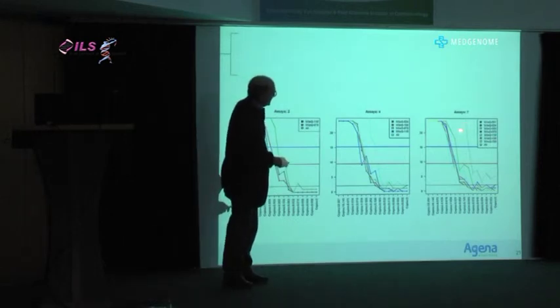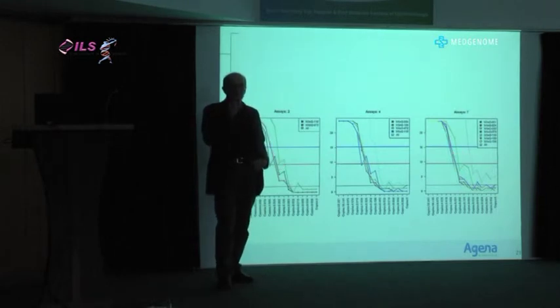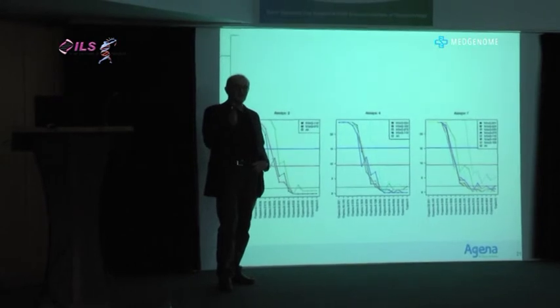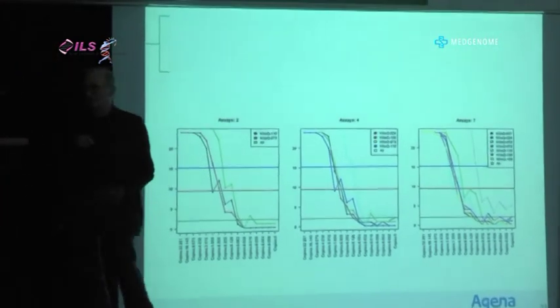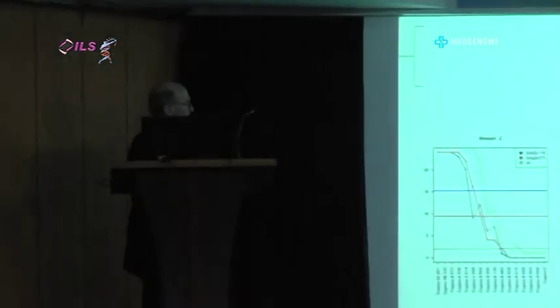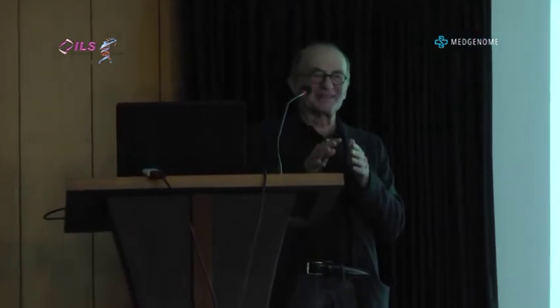And here the gray is scoring 1 of 7, and it's much more sensitive still. Okay? So by using multiplex assay and by fragmenting my target into as small pieces as my detection allows, I can gain, in this case, more than a log in sensitivity. I can actually detect, on average, less than 1 molecule. Okay? Because, in fact, I've blown it up to be many.